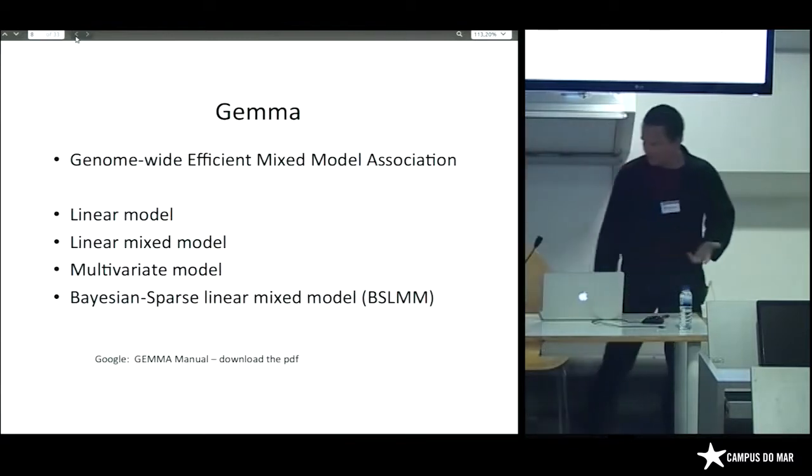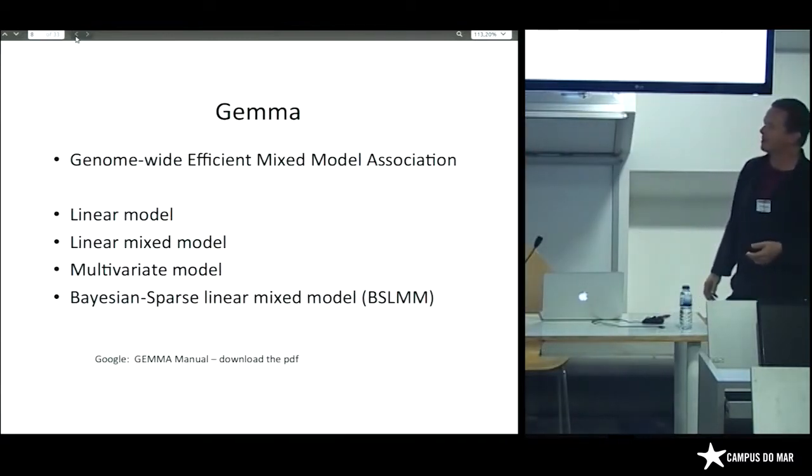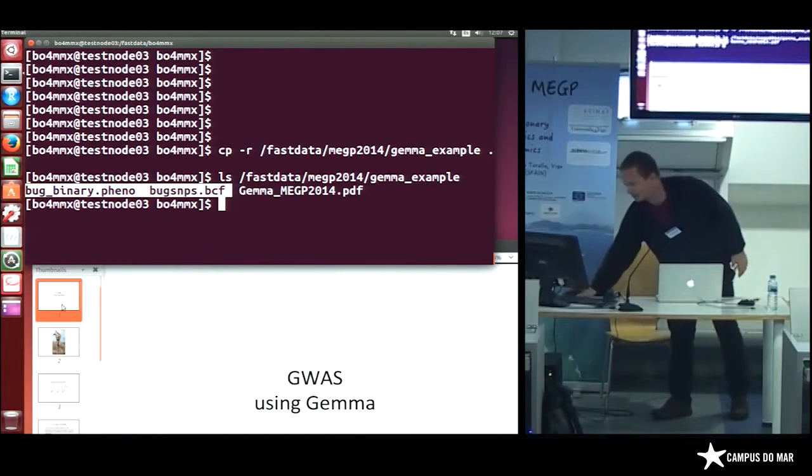So GEMMA stands for genome-wide efficient mixed model association. And you got yesterday morning.